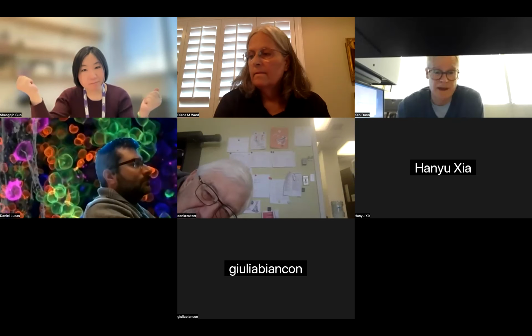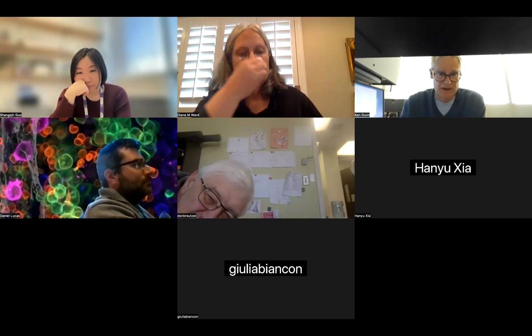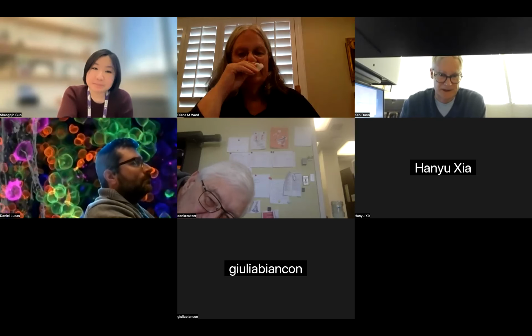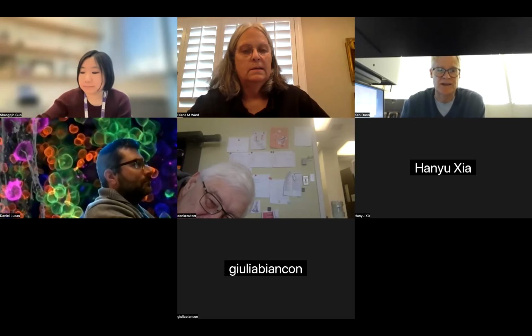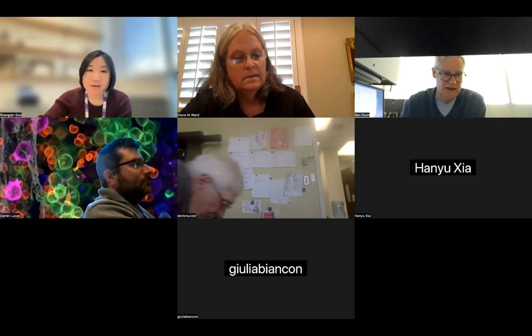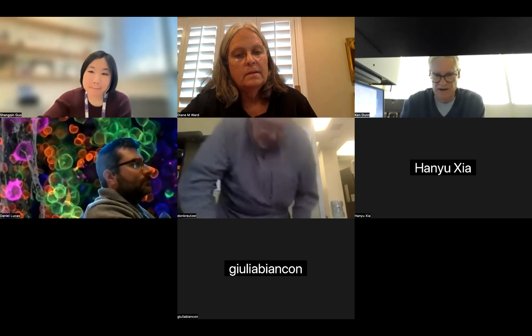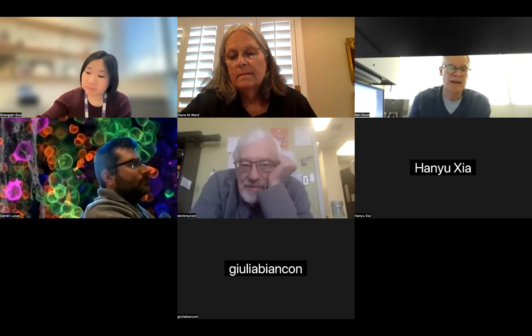I don't know what kind of signal levels you'd have. Whenever you're imaging something like this, it's a question of how fluorescent the thing is and how fast you need to characterize it. If you've got something that's not very bright and it's moving around really fast, nothing is going to work. I didn't emphasize the cellular level stuff at all; I really emphasized tissue.